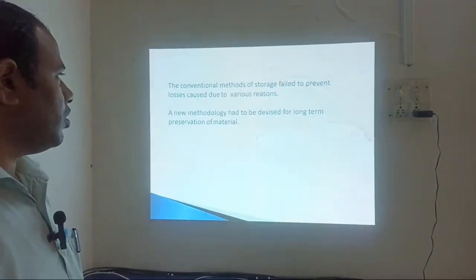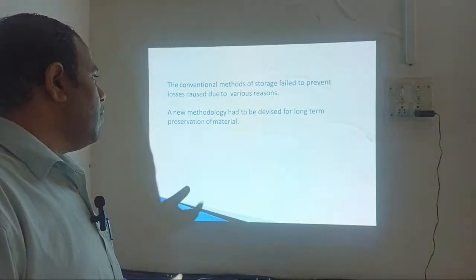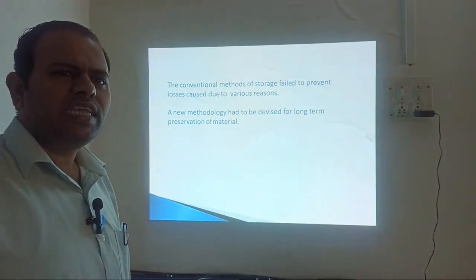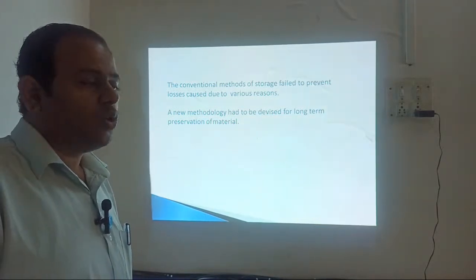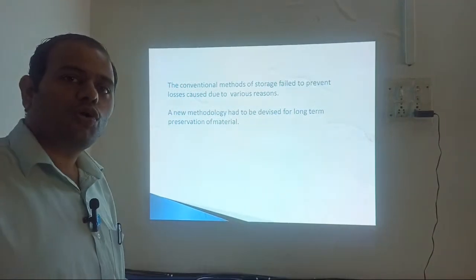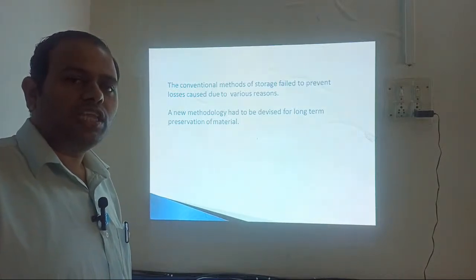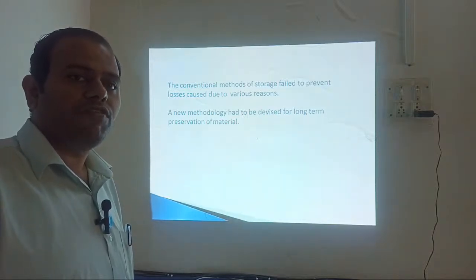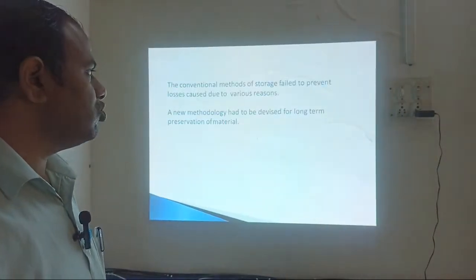So why is cryopreservation used? Remember, the other preservation methods present nowadays or earlier cannot preserve tissues or species for a longer time. Cryopreservation has the potential by which plant tissue or live tissue can be stored for a longer time, and the most important thing is that this tissue is viable. Meaning, this tissue is still alive even after the cryopreservation. Therefore this is one of the important techniques used for preservation.